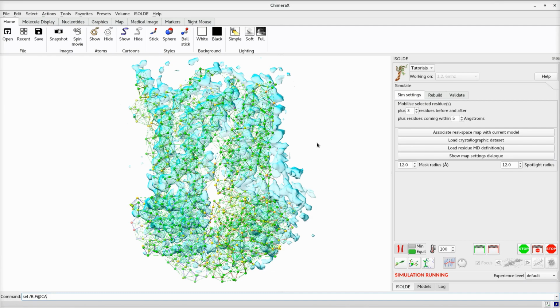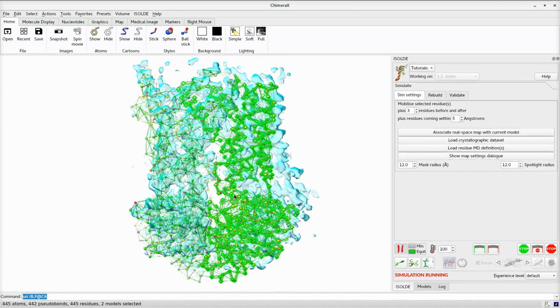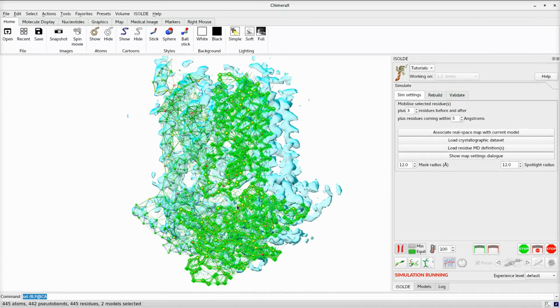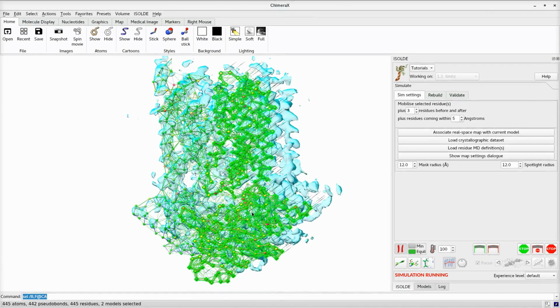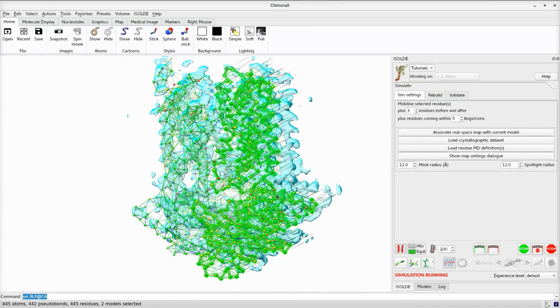In this starting configuration, the two chains on the right are a very long way out of the map. While given sufficient time, the simulation might settle to convergence on its own, in most cases it is much faster and more sensible to guide it with some judicious tugging.